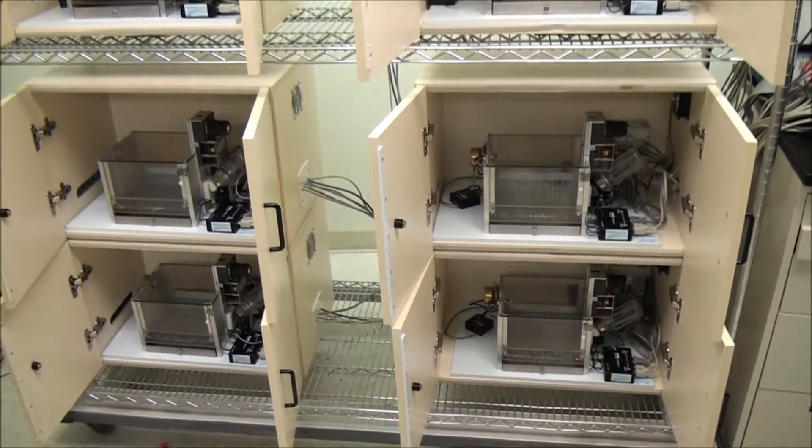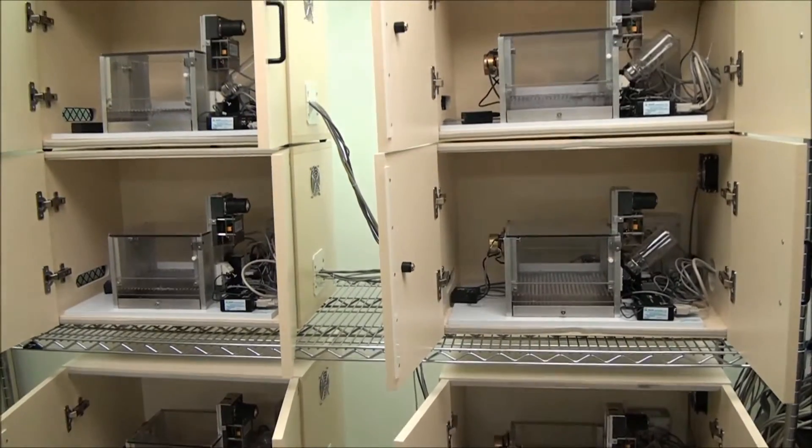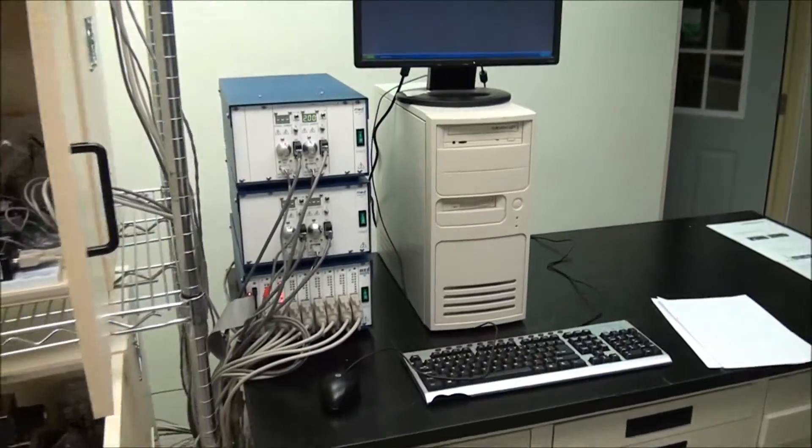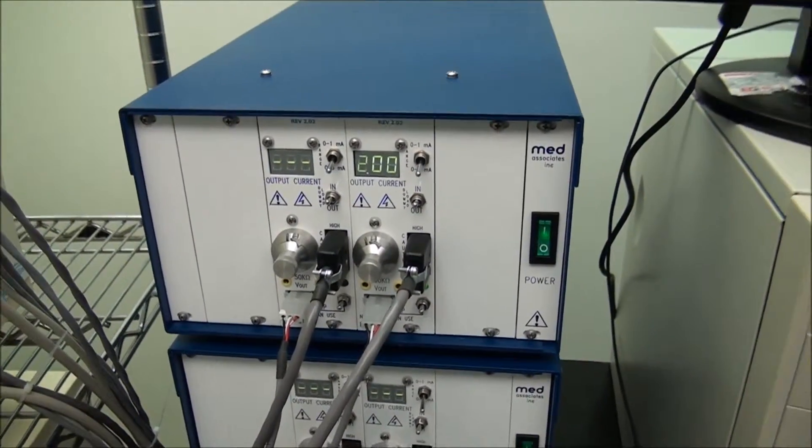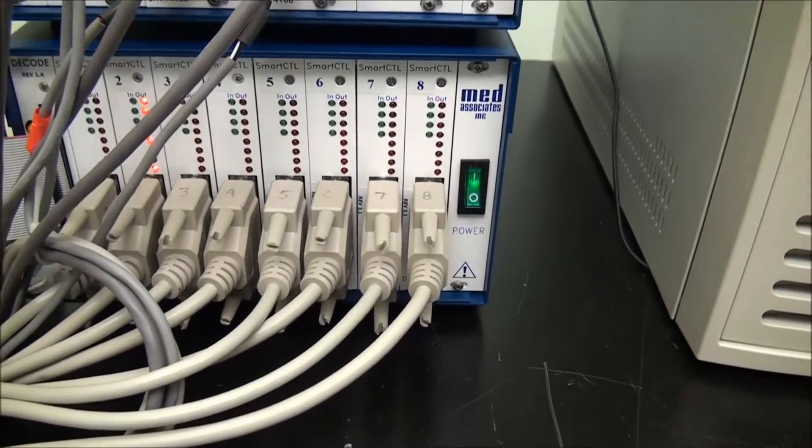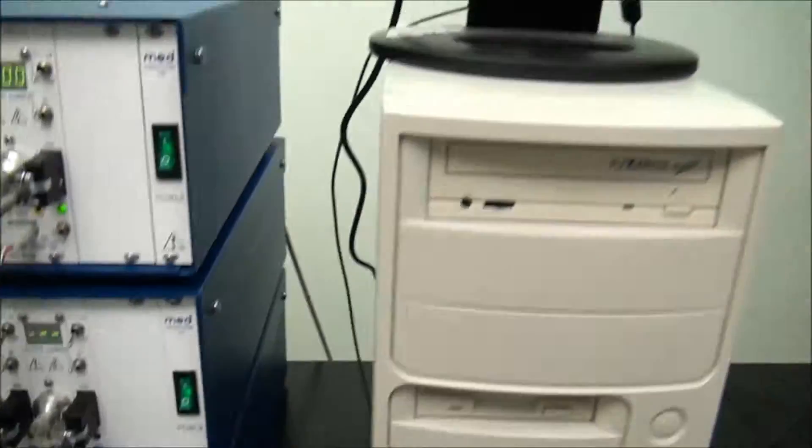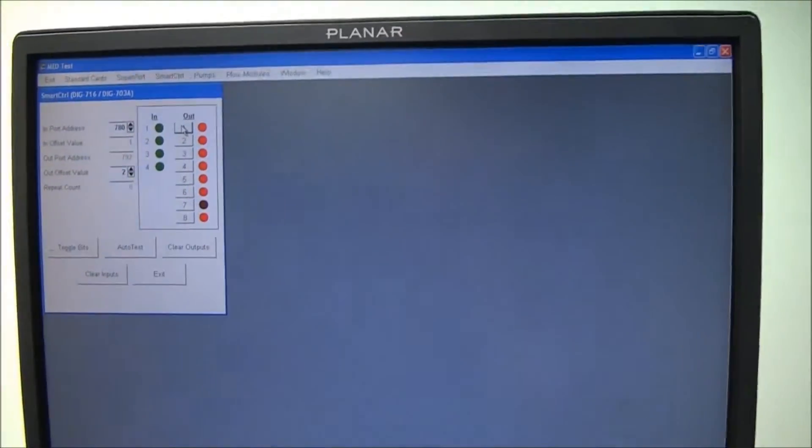We have eight chambers in total. We are willing to split the system in half where we could sell four chambers and one of the shock module power supplies. And then you'll also receive all the cards, the input and output cards here. Right now we're including it with the software computer as a complete system.